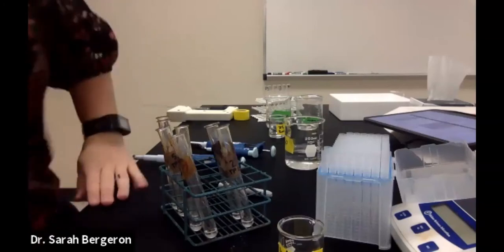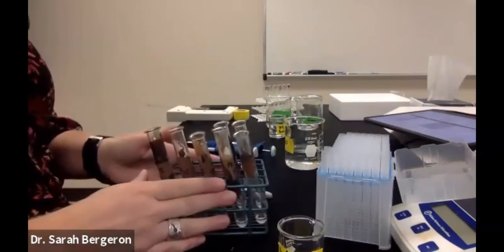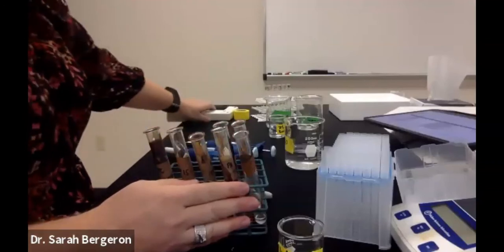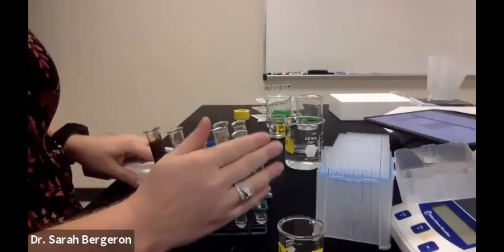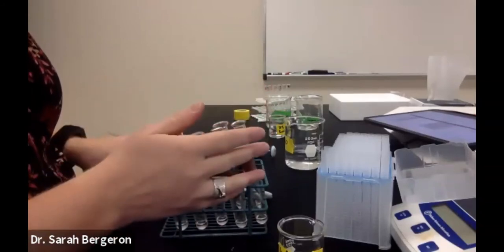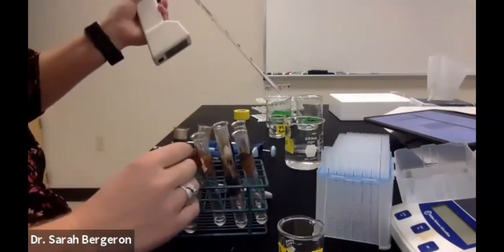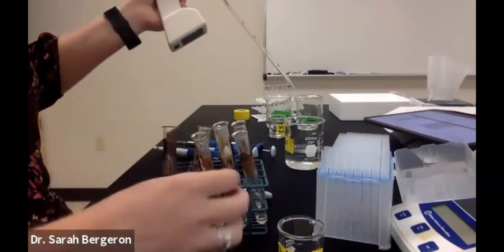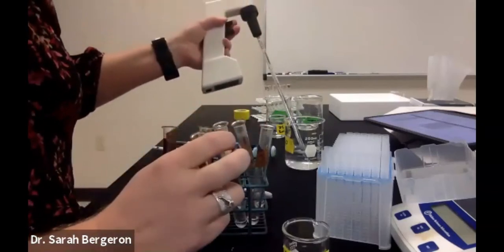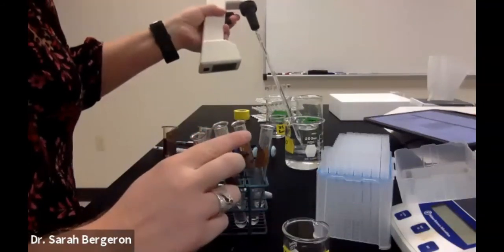Okay. So remember, we have our TLC samples in here, so everything you scraped off, and then you also already put perchloric acid in these. And so what you need to do is add 3.3 milliliters of water to all of them, add 0.5 mils of ascorbic acid to all of them, and then 0.5 mils of ammonium molybdate to each of them. So that's what we're going to go ahead and do. And I think I have these in order. Yeah, 7, 6, 5, 4, 3, 2, 1. Okay, so this time we're putting 3.3. So 1, 2, 3, 3.3.